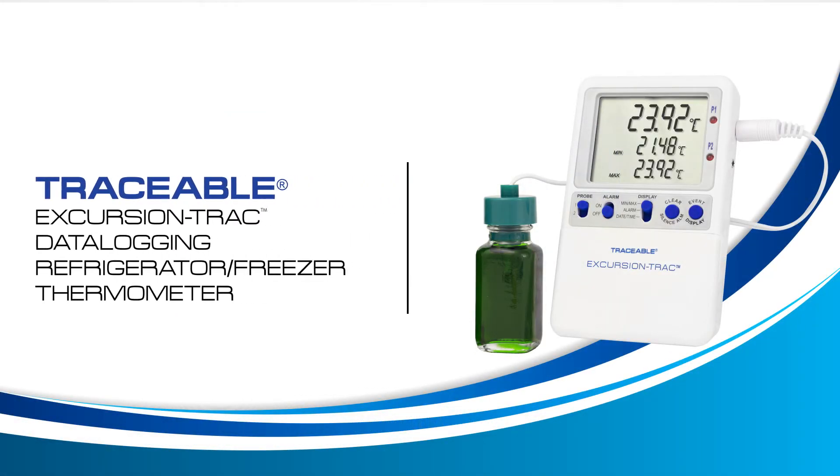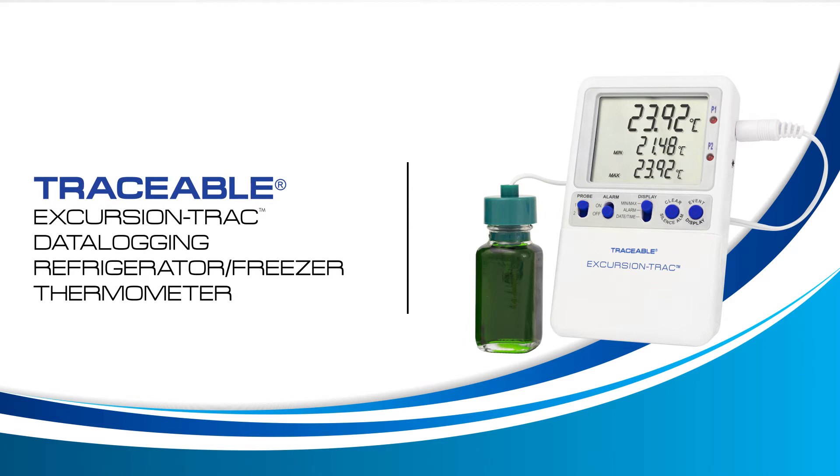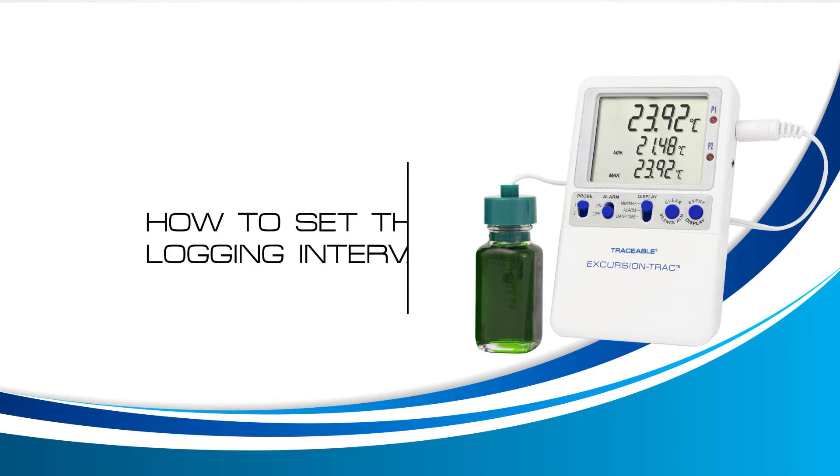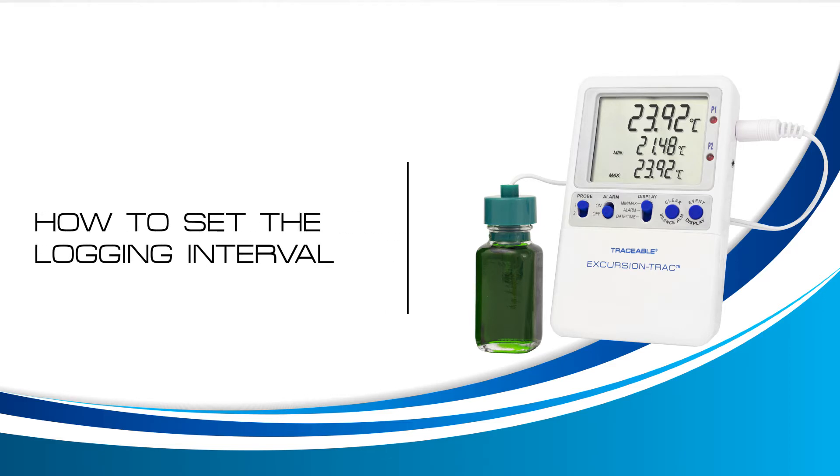Welcome to a Traceable Products instructional video for the Traceable Excursion Track Thermometer. In this video, we will learn how to set your logging interval. Logging interval is how often your thermometer will record a temperature reading. By default, your device is set to record a temperature reading every minute, but this can be changed to fit your working environment.